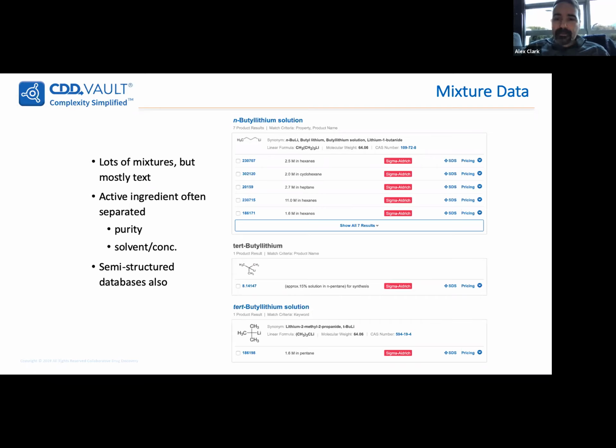And so if information is being kept in these standardized formats that are pretty complete, you can put it somewhere where it lasts forever. You don't have to worry too much about losing it. And also you can start to leverage software for getting people up to speed so they know what's going on.